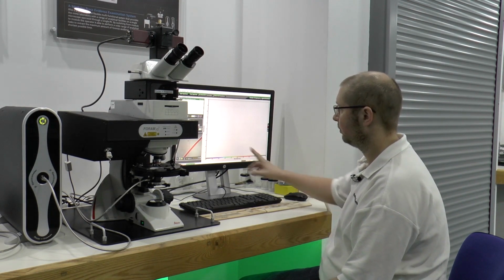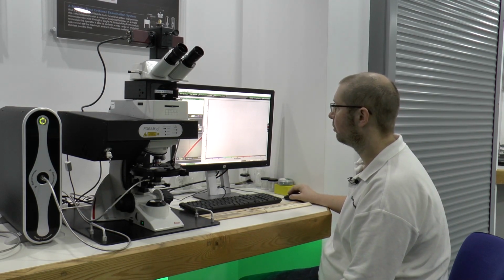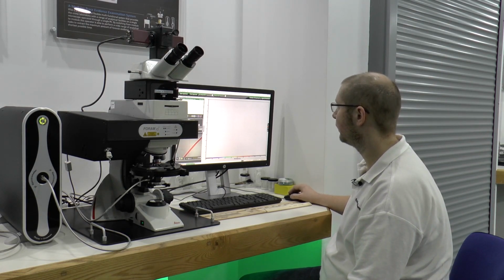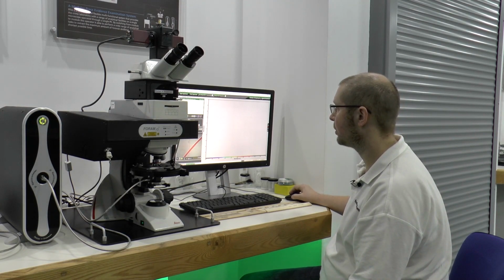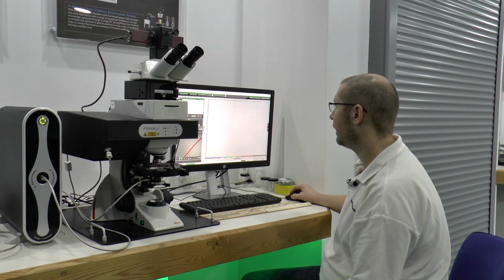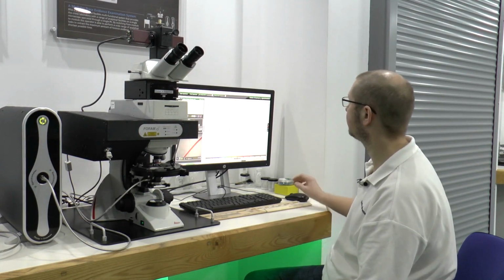Okay, so the first step, here we can see we've got the fibre in focus. We need to record our white reference or our transmission reference. So we'll click that, and then the system will automatically determine the scan time based on the amount of light that is transmitting through the system. And it will record that 10 times, which I've set here as the number of repeat measurements it will take in order to create a spectral average. This just improves our signal to noise.